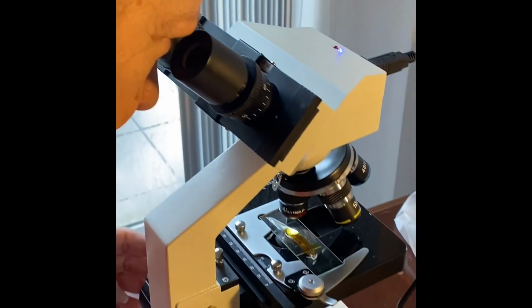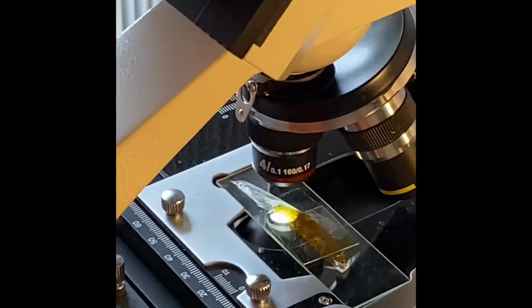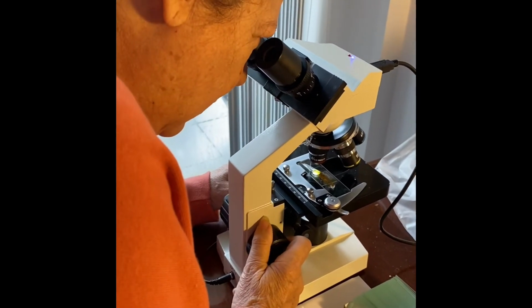Turn on the light, looking through 4x. Look for the brownish color on your cell and focus in with 4x, and you will see a beautiful picture of the onion membrane with all its nuclei.